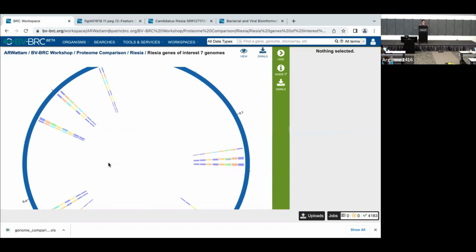And it's different, right? But this might be something you might want. Sometimes it's an interesting way to look at things. Imagine if you're interested in a pathway, and often in bacteria, but not always, they assemble the genes that they're using together all in the same place on the contig, so it can just run right through, or maybe you're looking at an operon or something like that. So you might want to show it that way. Or it might be disparate. So that might be a reason why you might want to look at these things.